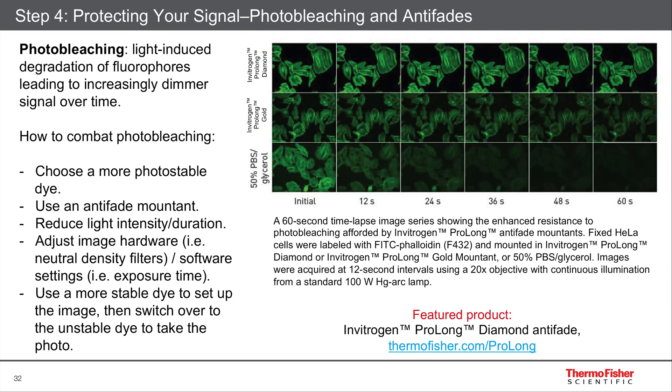Here's an example of that photobleaching I mentioned in this gallery. You can see that in the bottom row is just PBS with glycerol, and this dye — fluorescein, or fitzy, phalloidin — photobleaches away and becomes dim very quickly. Whereas if you use Prolong Gold or, even better, Prolong Diamond, you see that you retain your signal over that entire minute.